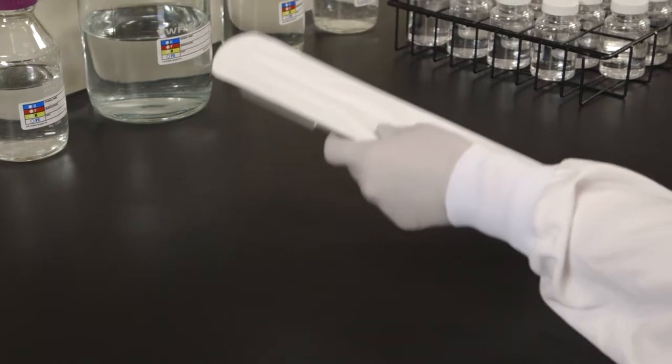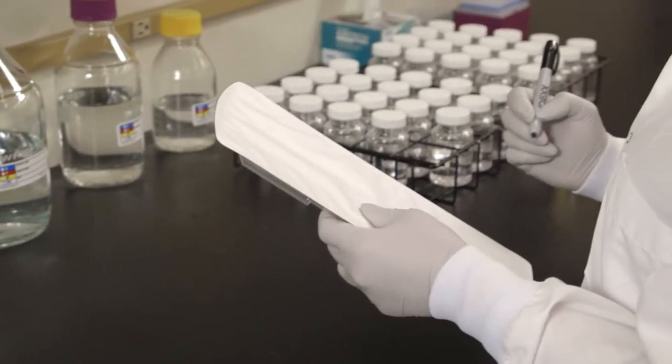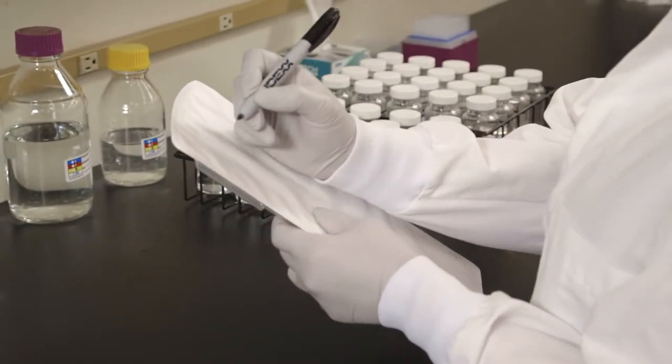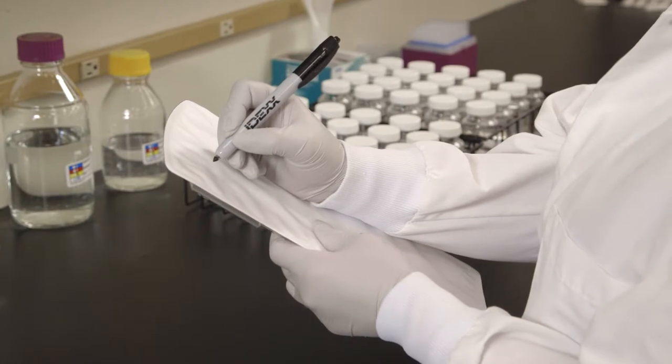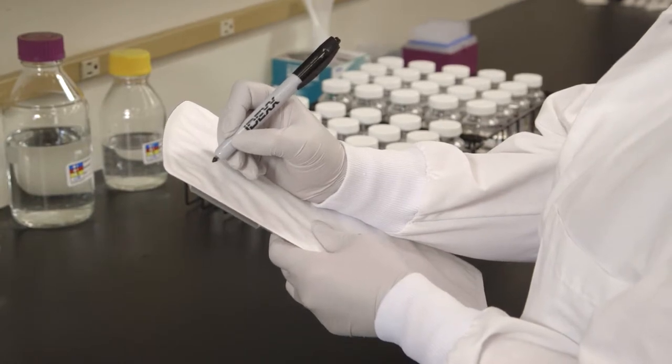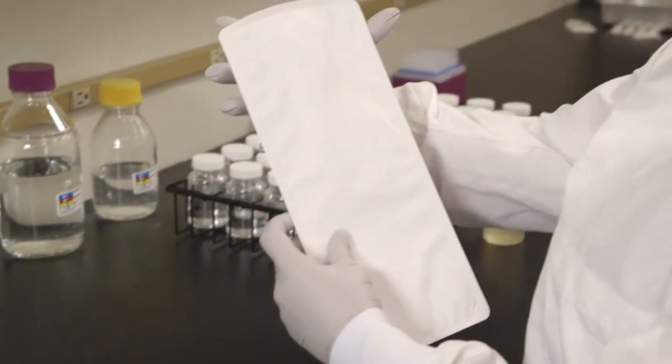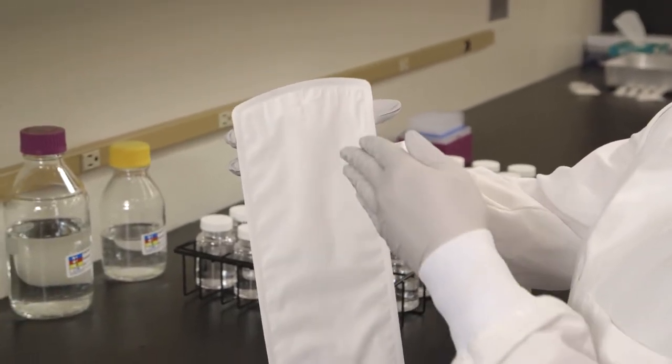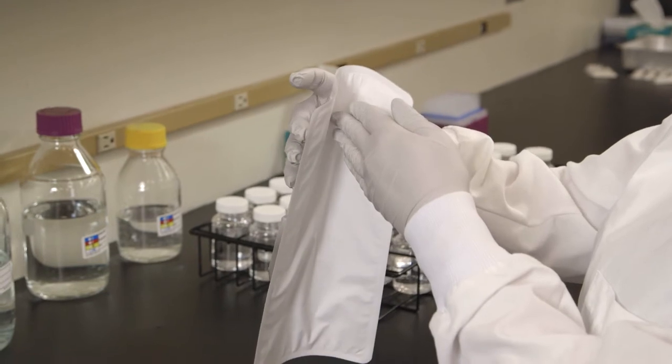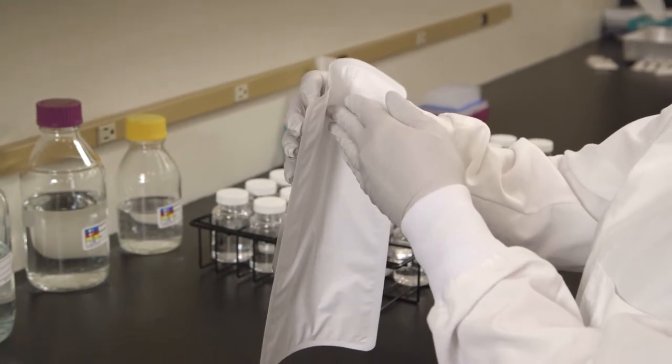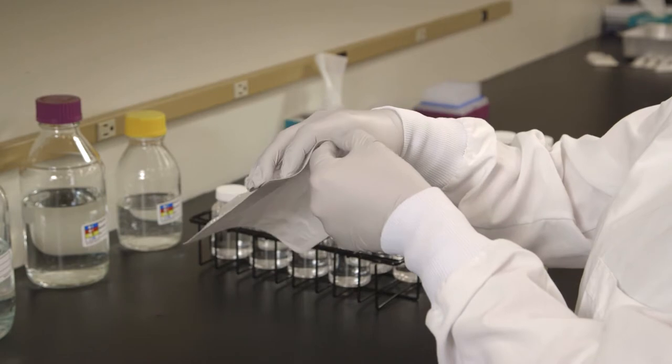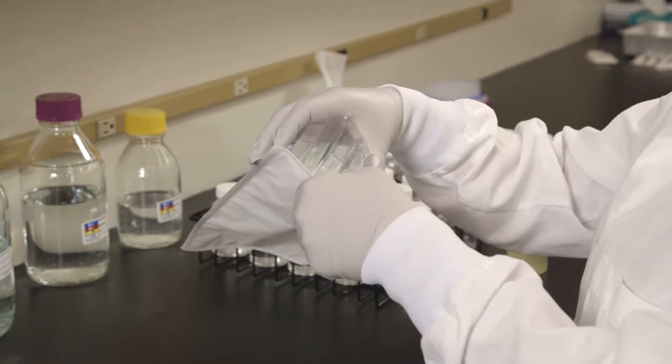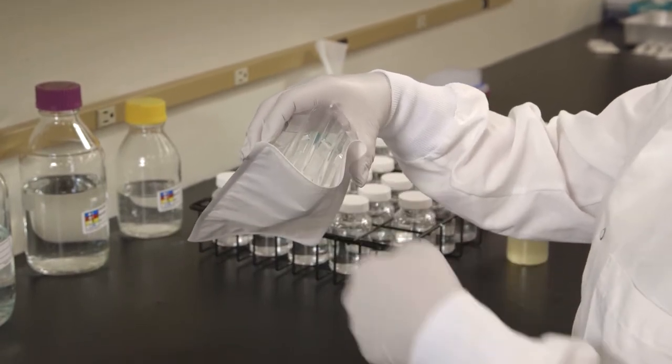Use only a permanent felt tip marker to label the Quantitray LEG-ALERT tray. Adhesive labels may adhere to the sealer roller and ballpoint pens may puncture the paper. Hold the tray at the top with the well side facing your palm. Push the top edge of the tray in with your free hand while squeezing the tray into a circle. Open the tray by pulling the back away from the well side. Avoid touching the inside of the tray.